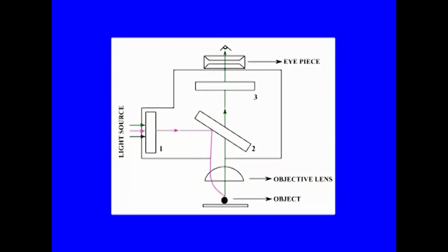That is a very simple schematic, but like I said, the epifluorescence microscopes are mostly used rather than a simple schematic. So, here is the schematic of epifluorescence microscope. So, what happens here? You have a light source, and this light source in confocal it will be laser, as we will see. Now, there is an optical filter here at number 1 position, which allows a particular wavelength, and the first filter allows a blue light, though it is shown here in a different color, but it has to be wavelength between 450 to 490 nanometer light is allowed, but it could be different things, but here we are showing a particular arrangement.